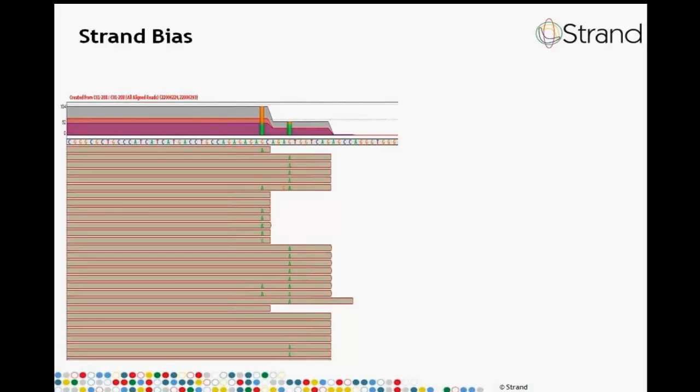The genome browser included in Avadis NGS allows you to modify the genome browser views in multiple ways. One of them is to plot the coverage of the positive and negative reads. For instance, one might be interested in how many positive strand reads are overlapping this location and how many negative orientation reads are overlapping this location. And those two coverages are drawn in different colors out here. One is the positive coverage and one is the negative coverage. And one can see that there's approximately uniform coverage in both orientations. So we have something like 48 reads overlapping in one orientation, maybe 54 reads overlapping in the other orientation, for a total coverage of 104.